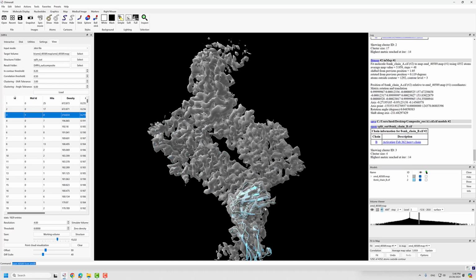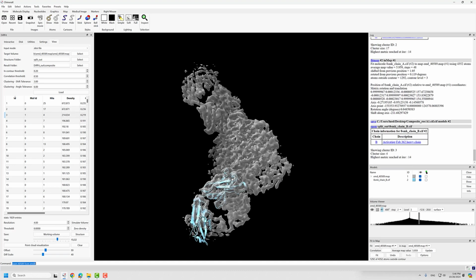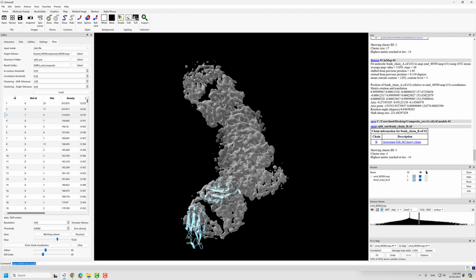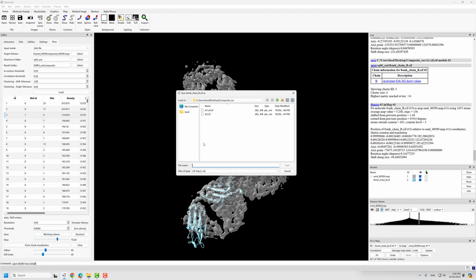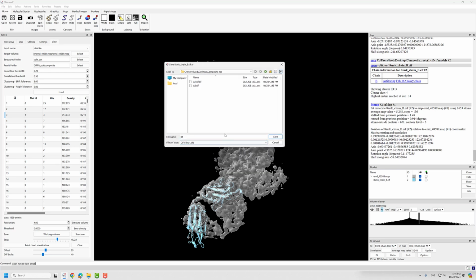And we have one occurrence of the B chains. Let's fit it and save the structure B1. If I recall correctly, all the copies that's at the lower side is the first occurrence. Later on we will see why this will make our life easier, but this is not something critical. This is B1.